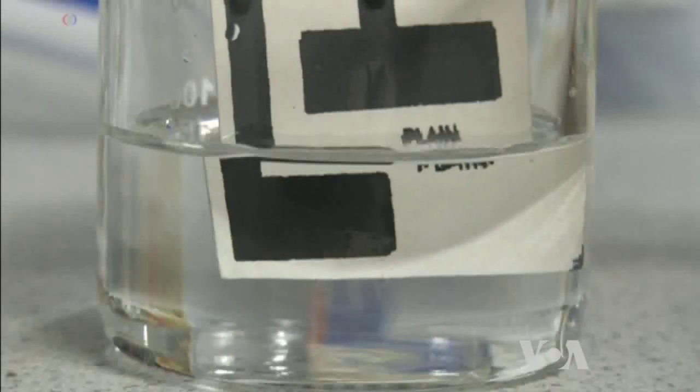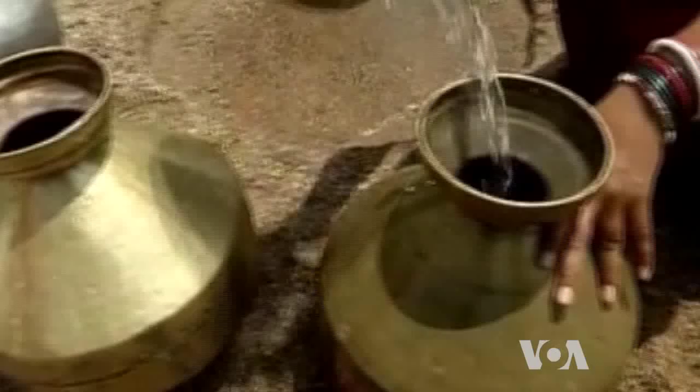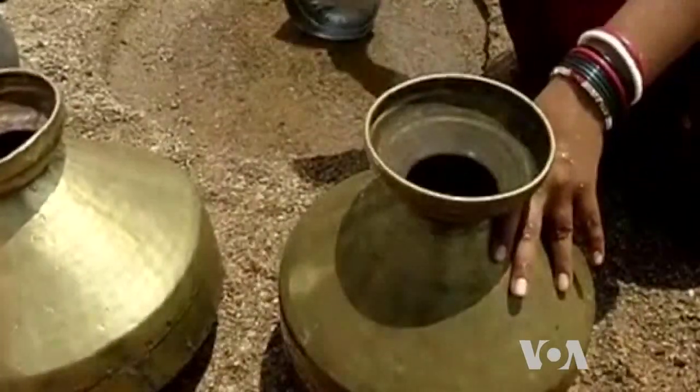It's like a warning tool that tells you outside: yes, the water is safe or not. Researchers say when mass produced, this biofilm device will cost just over $1. George Putic, VOA News.